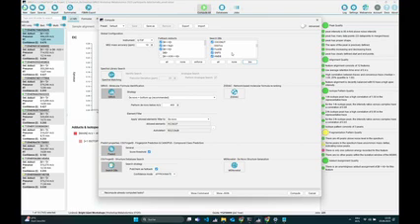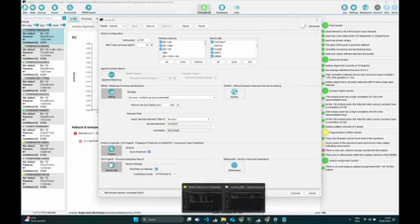And how likely is it to provide a wrong annotation if it is a confidence score of 0.8? The only thing I can say from the top of my head is that 0.6 is 10% FDR, and then 0.8 is less. I also have to look it up. Do I have it here? Maybe I have it here. Let's have a quick look.